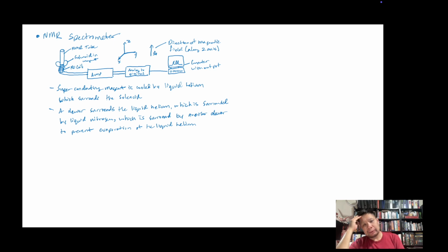And when you mine for it, helium is, at standard temperature and pressure, a gas. So a lot of it just dissipates into the atmosphere and goes into the universe. It doesn't stay on Earth. So it's really hard to mine, and that's why liquid helium is so expensive, super expensive and super cold.